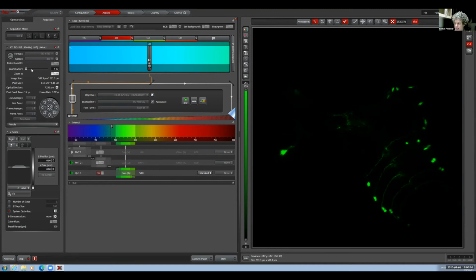So that can't be seen by students on Zoom. Correct. They will not be able to see or use that to run it remotely. But someone who's sitting at the system, it's really nice. Oh, absolutely. It's great for me. I'm just remembering that I'm going to have to learn what you're showing me on the screen first.